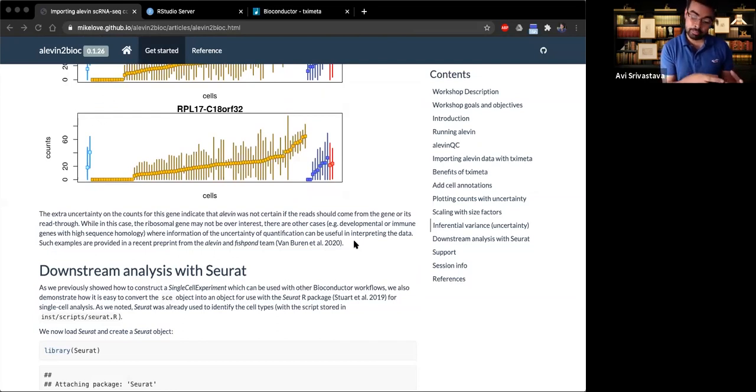In bulk RNA sequencing, it's actually a relative count where you normalize everything to 1 million and use length bias and positional bias. But in 3' sequencing, there is no correction for length bias, and it's an absolute count in a pseudo sense, because you are taking one read and dividing it into fractions based on the distribution. Overall, if you sum the counts, it's not going to sum up to a million. It's going to sum up to the number of deduplicated UMIs, which are supposed to be distributed. But I do not understand the second part of the question.